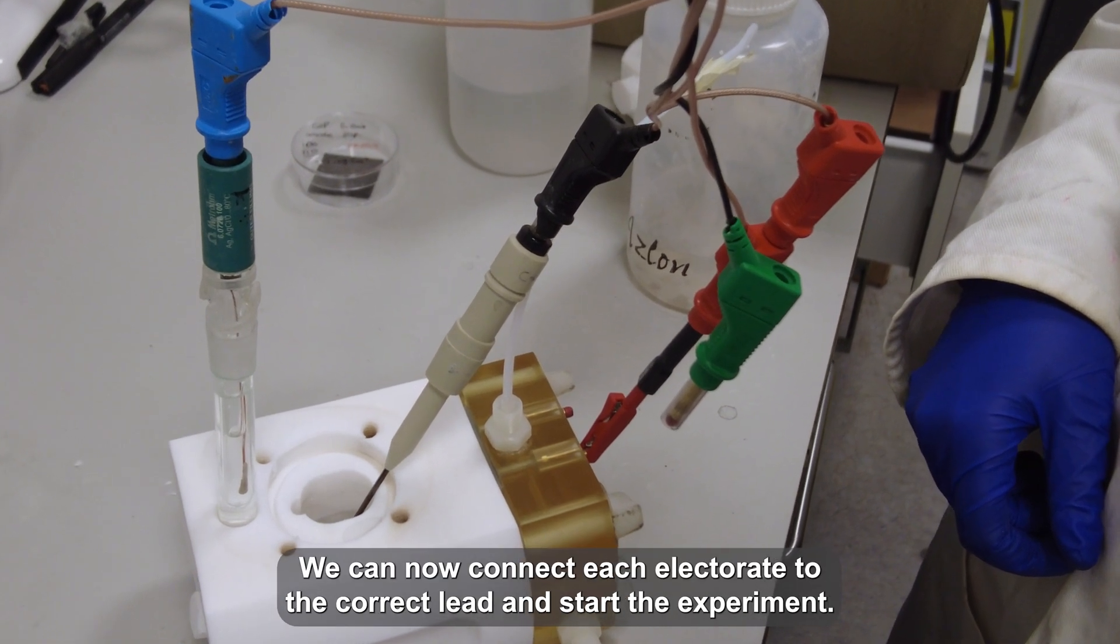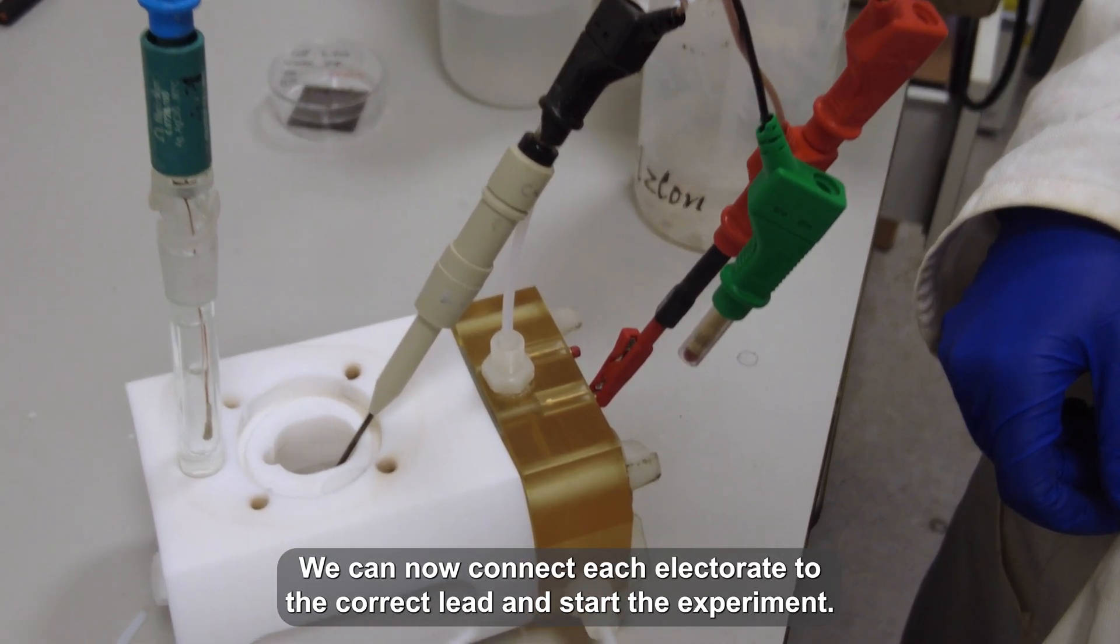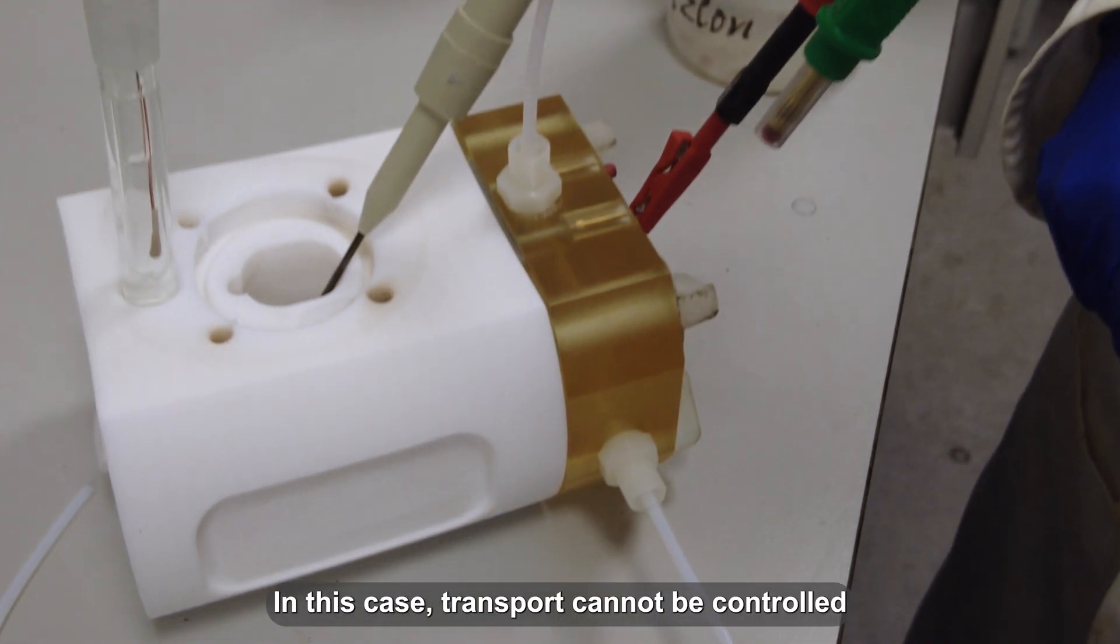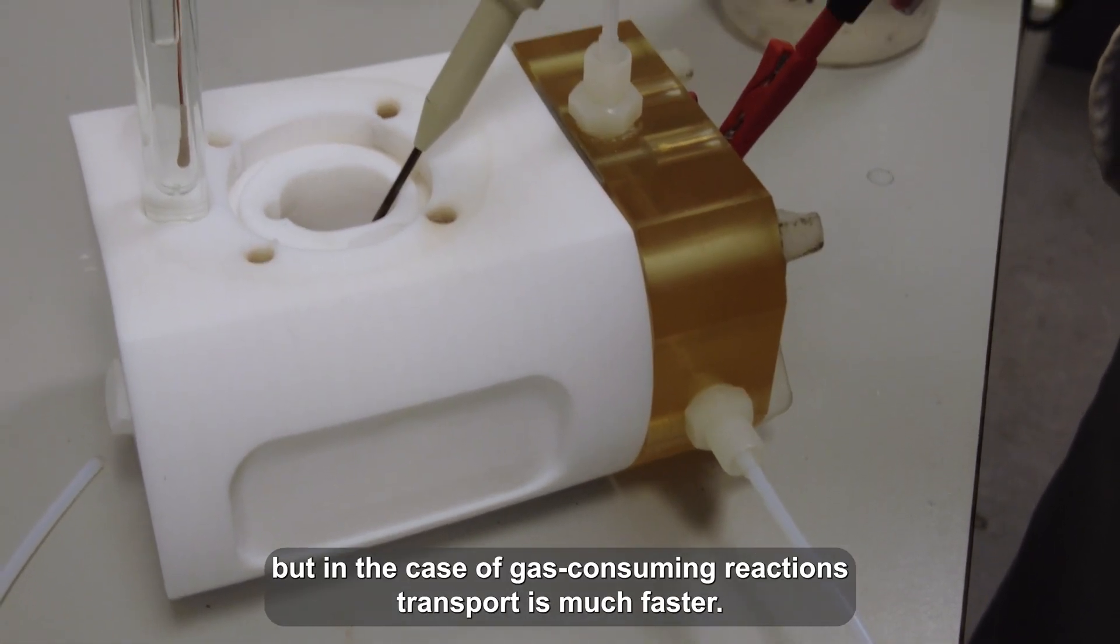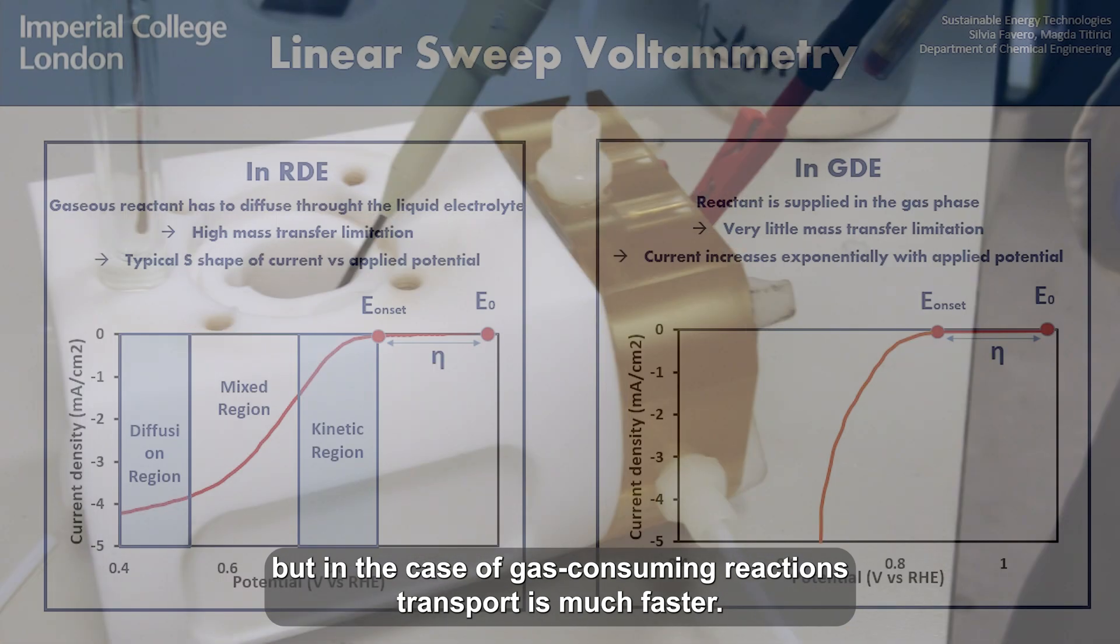We can now connect each electrode to the correct lead and start the experiment. In this case, transport cannot be controlled by rotating the working electrode, but in the case of gas-consuming reactions, transport is much faster.